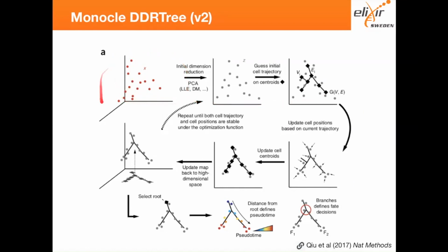So imagine that you have your points in a multi-dimensional space, and then you apply any dimensionality reduction: Diffusion Maps, ICA, TSNE, UMAP, you choose. Then you can guess some initial trajectory and design some clusters. For example, for these cells, a cluster will be here, for these cells kind of here, here, and so on. You can cluster them in different ways and methods as well. Initially it was k-means, as you also heard in the clustering technique. Nowadays, there are many variants. We can do graph clustering, for example.